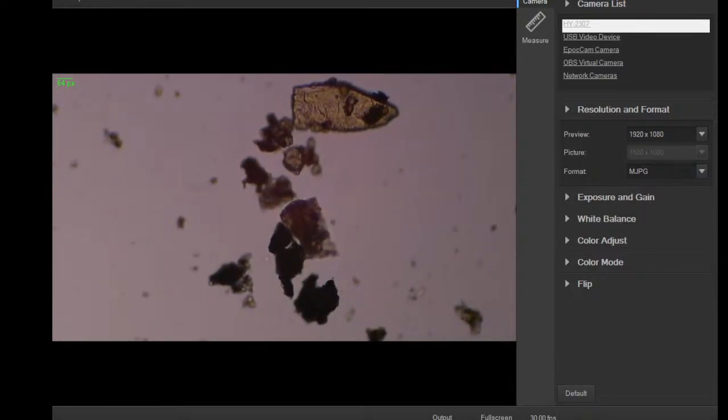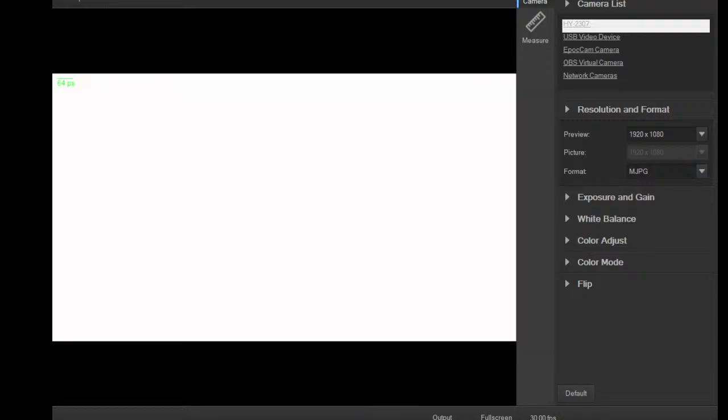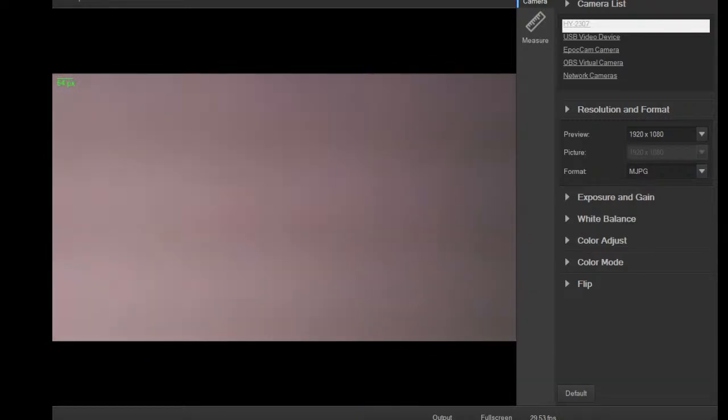Yeah, so that wasn't too bad. Let's make another quick one from that tube. I have two tubes of crap that I collected here. Let's try another. Stir up the sample a bit, see what I can find. I guess there are little kind of benthic things on the bottom. Okay.